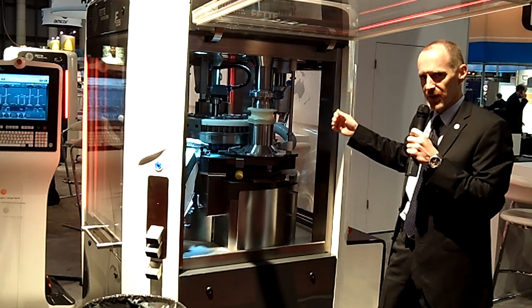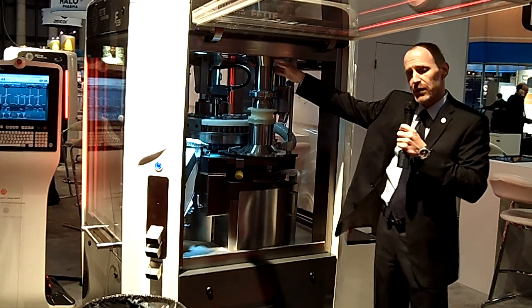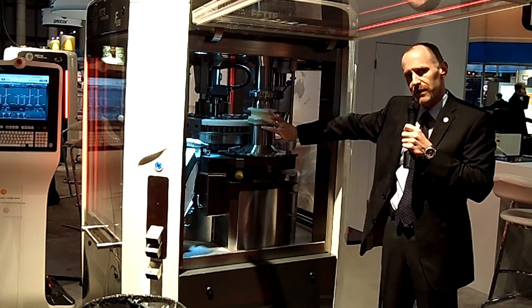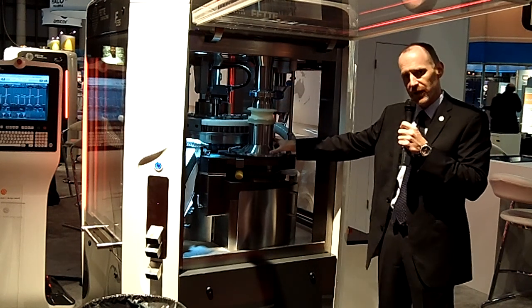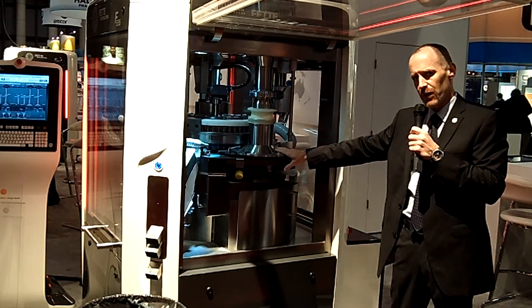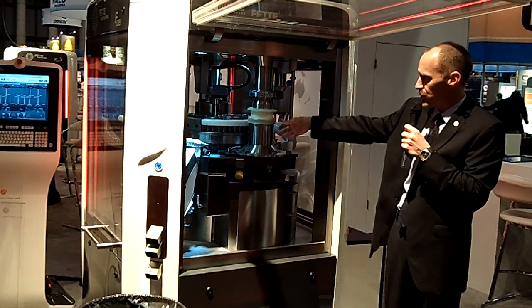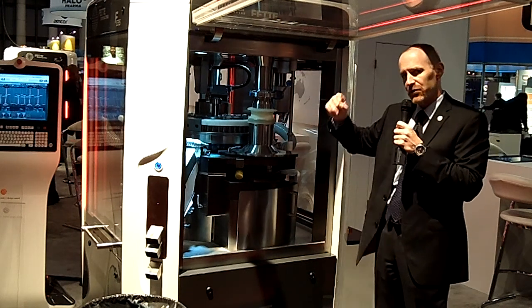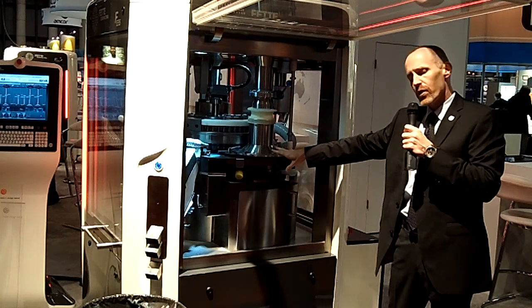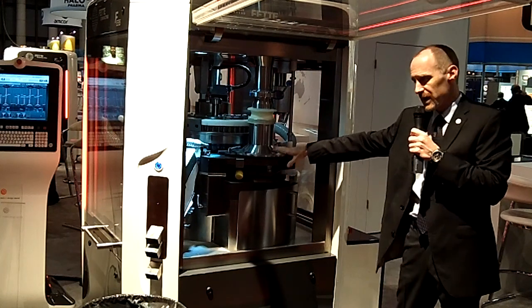Fully automated sampling features. As we go through the press, if you think of a granule being introduced into the hopper, you can see that you have a very unencumbered gravity feed down to the new filling cone. The filling cone makes use of one paddle only. It has an inverted conical shape, so that as the granule enters the feed frame, it cascades over the point of the cone. Pre-filling and overall filling times have been optimized for more efficacious filling of the die cavities.